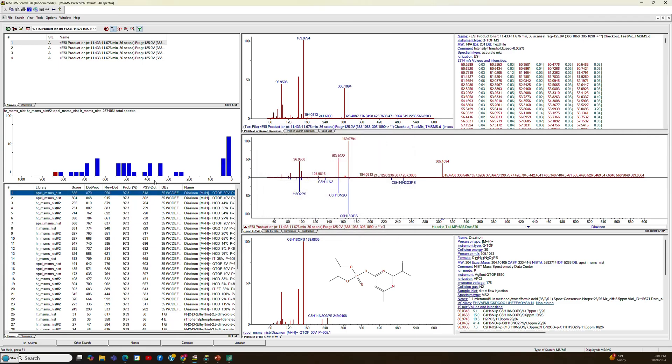That pretty much gives you an idea of how easy it is to do an MSMS search.